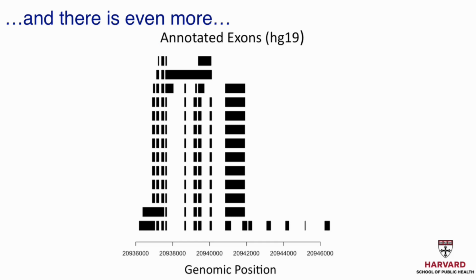So one of the new possibilities that RNA-seq opens up is the ability to distinguish these transcripts. So you might have a sample where even though the gene expression for a given gene is the same in the two samples or the two populations, in one population you see an overrepresentation of one of the transcripts compared to the other. That's something that microarrays can't measure. But with RNA-seq, we can. So RNA-seq opens up the possibility of measuring these different transcripts.